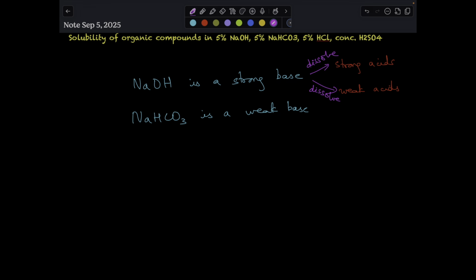When you come to sodium bicarbonate, being a weak base, it can dissolve only strong acids. It cannot dissolve weak acids.